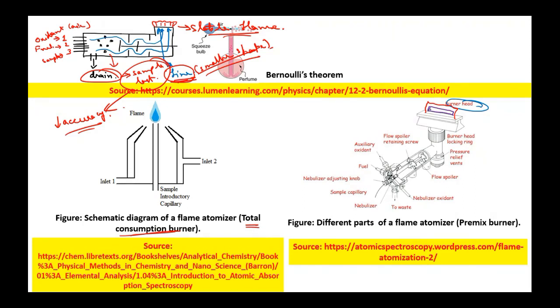That means whatever this rectangular box I have drawn, the light will be passed through this rectangular box like window. Okay, so in this way you are able to capture as much information as possible from the atoms which have been atomized. And in this way we artificially increase the signal to noise ratio for the analysis of the atoms over here.